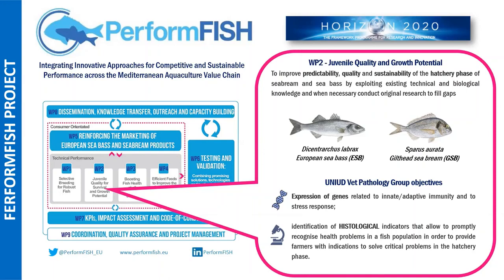In particular, we were carrying out two research lines. The first was the evaluation of the expression of genes related to innate and adaptive immunity and stress response. And the second, the topic of my presentation today, was the detection of histological larval and juvenile quality indicators, or hallmarks.